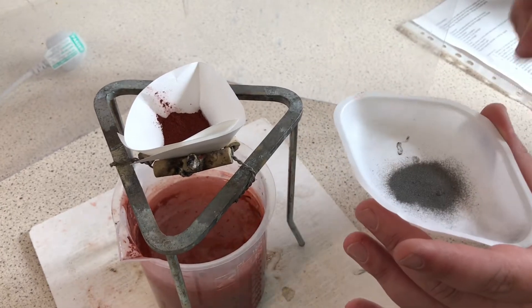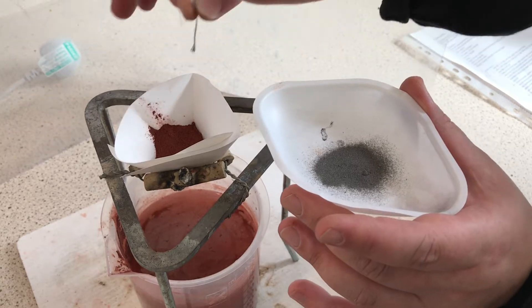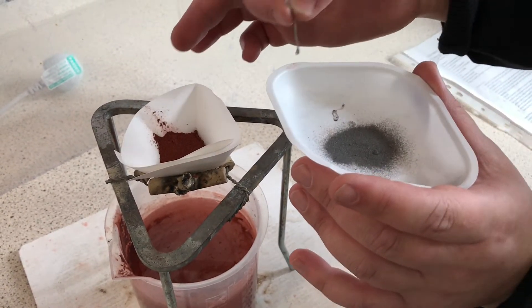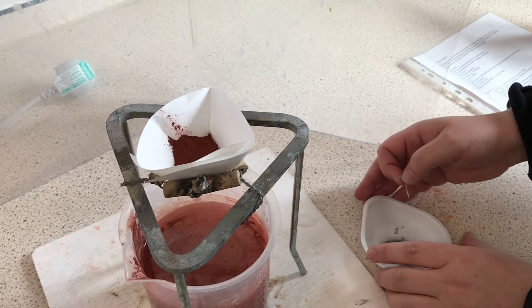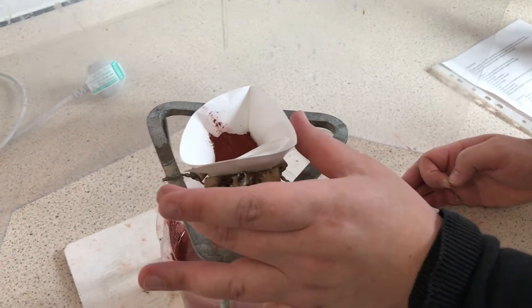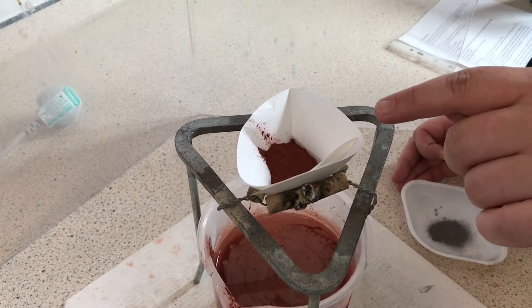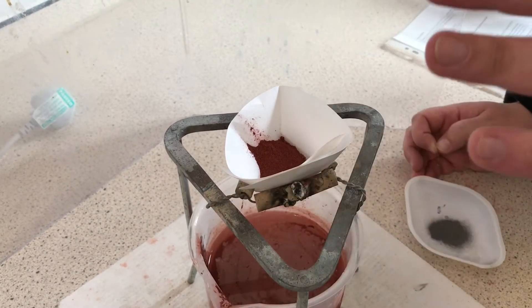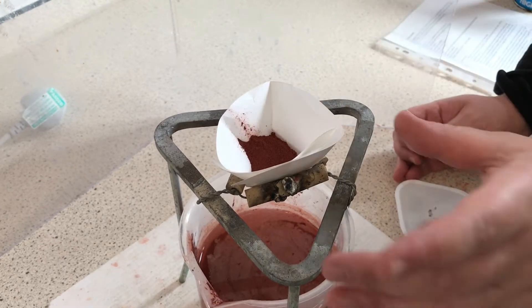I'm going to pour a tiny amount of magnesium powder into the middle, then stick this magnesium ribbon into the top as a fuse. Once we light this strip, the powder will light and produce enough heat to cause a reaction in the thermite mixture. It's a displacement reaction — at the moment iron is present but it's there in the form of iron oxide.